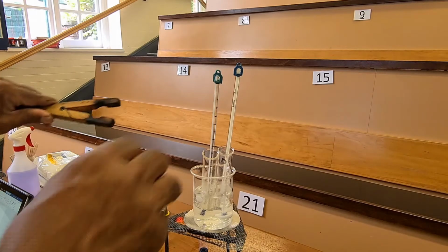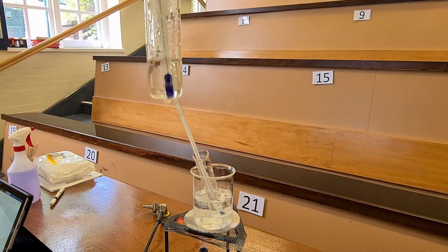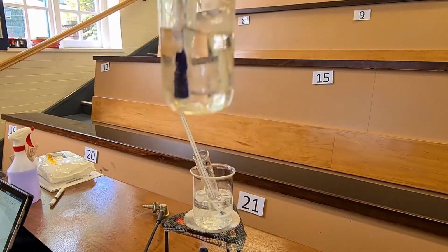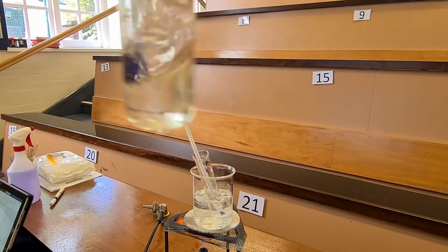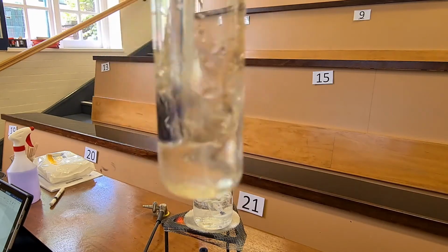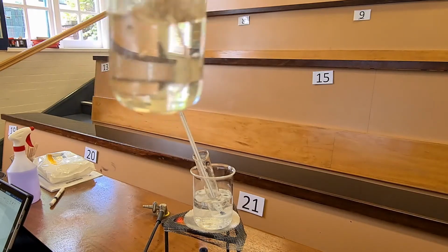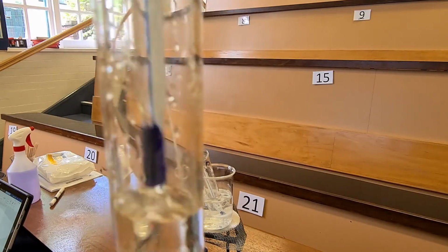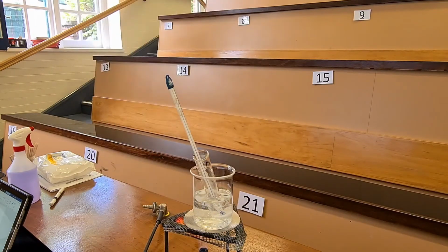Here, got a holder. I think that's probably better. You can see that I think a lot of it has dissolved. Stir it all up. Push down any crystals that are up there. That is C.